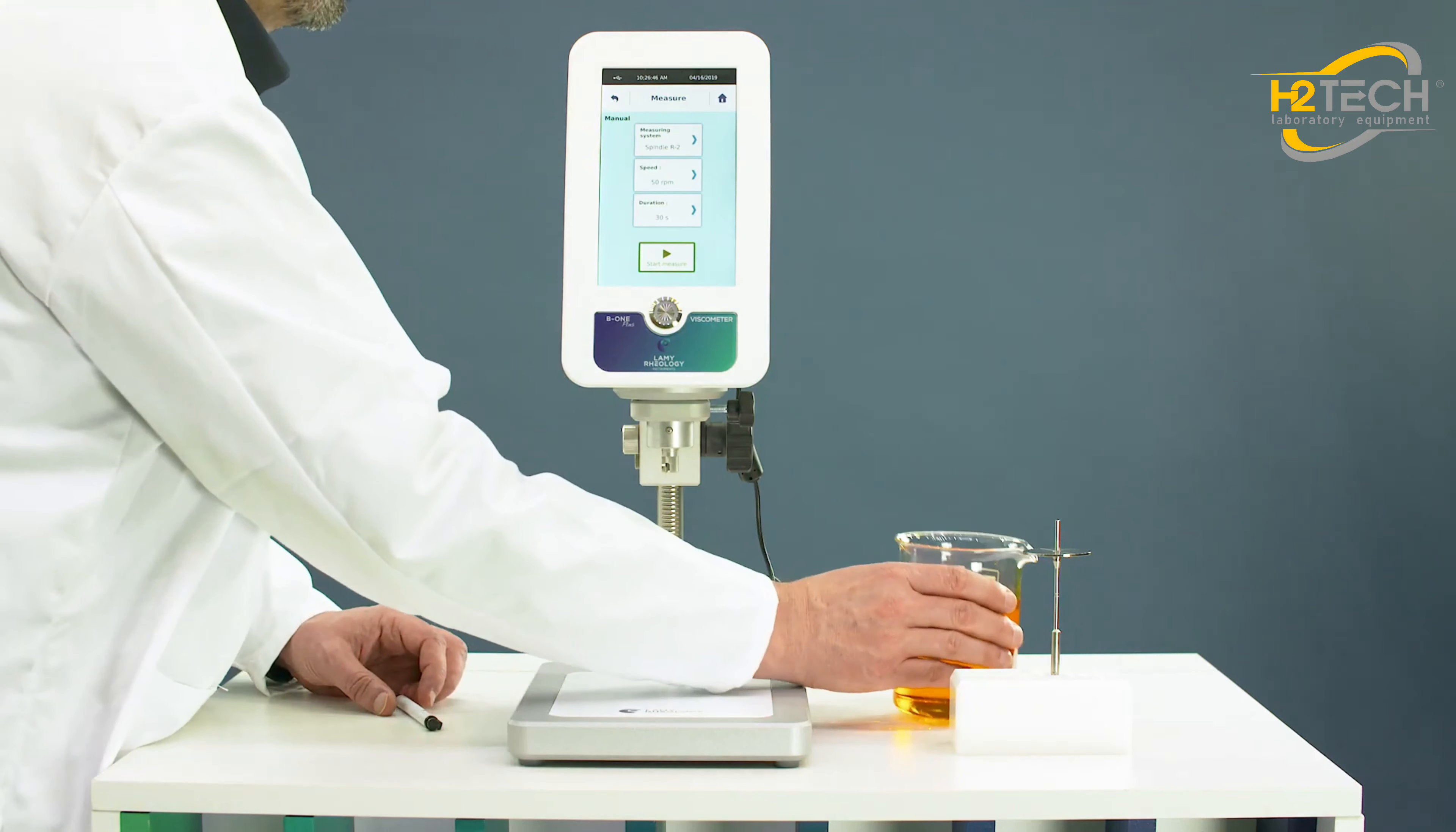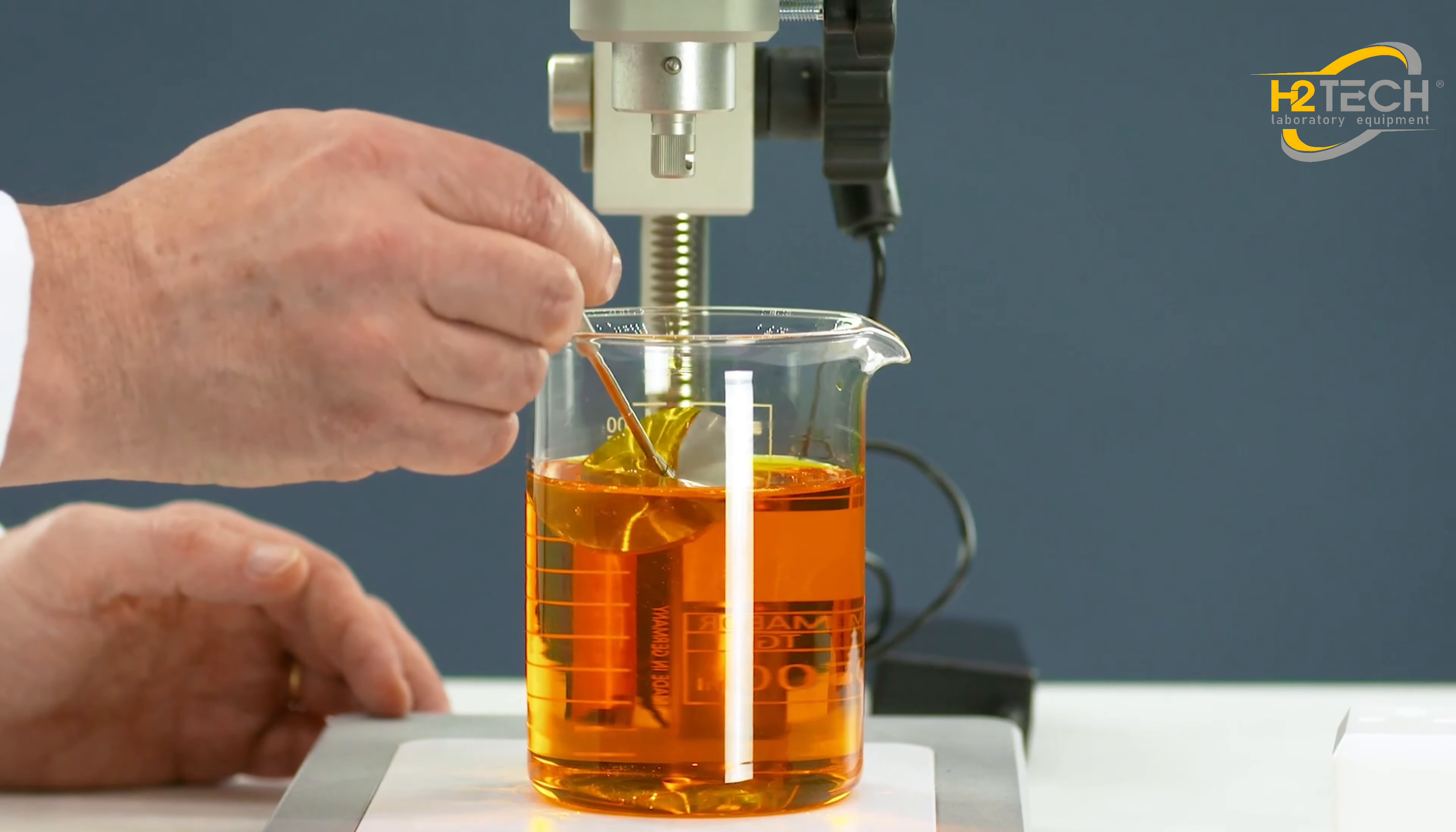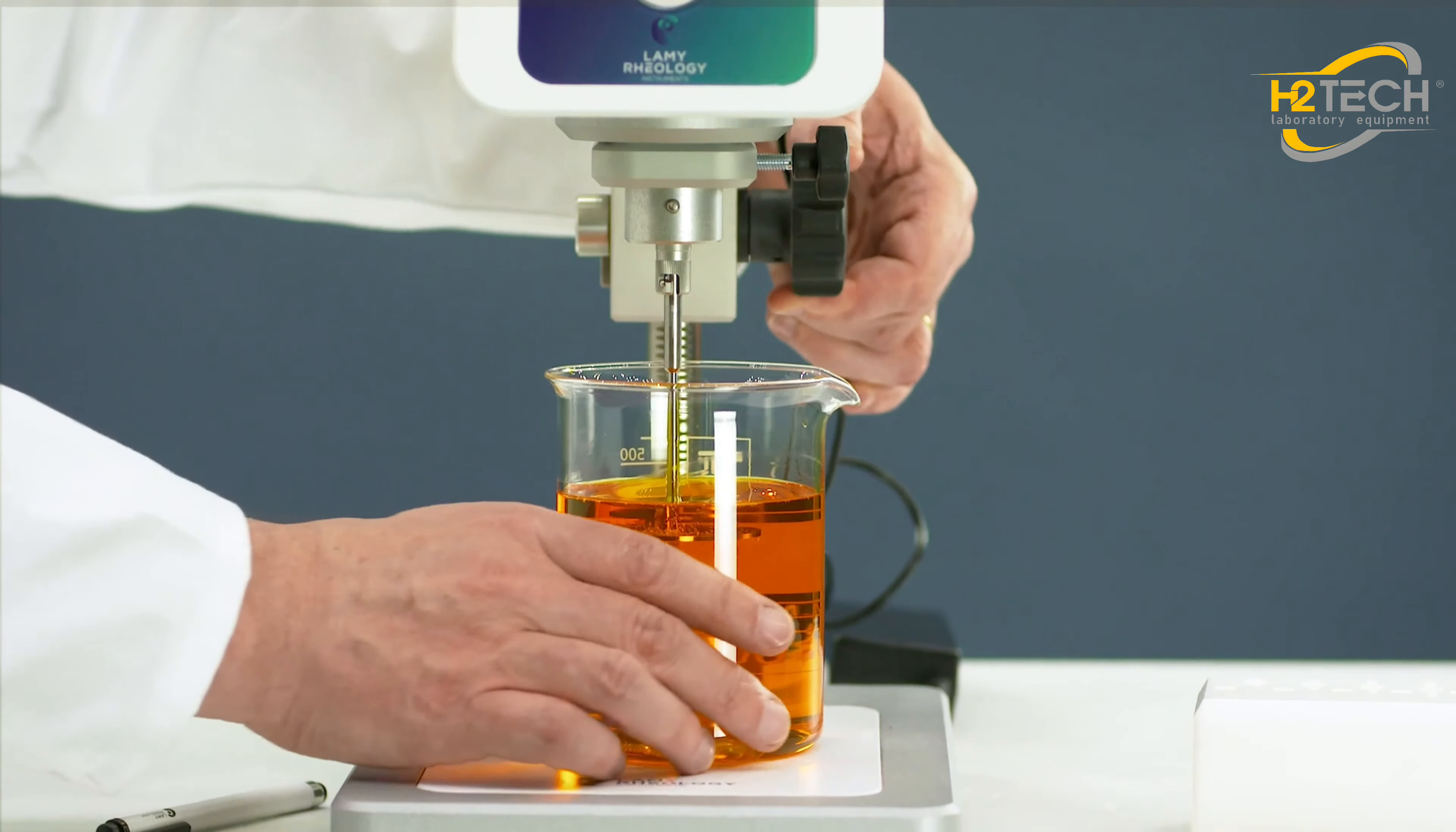Take beaker with the sample and place it below the device. Take the spindle and tilt it obliquely to avoid air bubbles. Connect the spindle with easy bayonet coupling. Reach the perfect position by using the mark on the spindle's shaft.